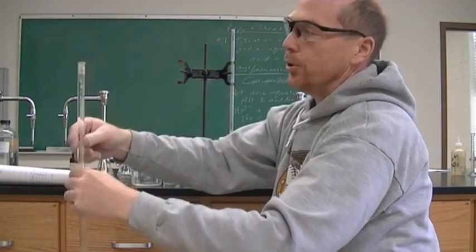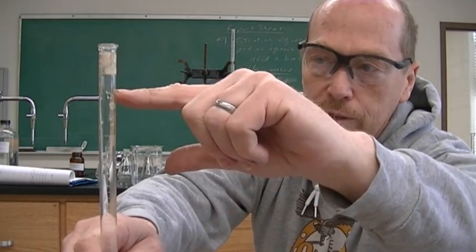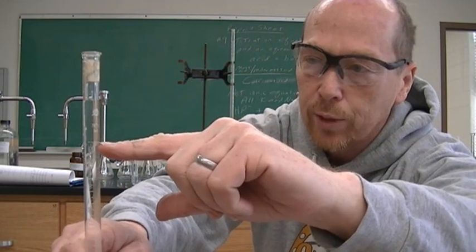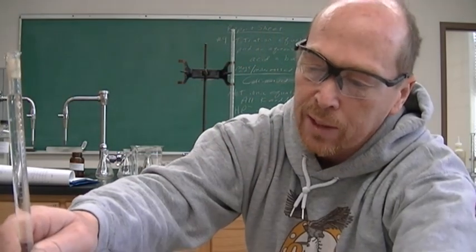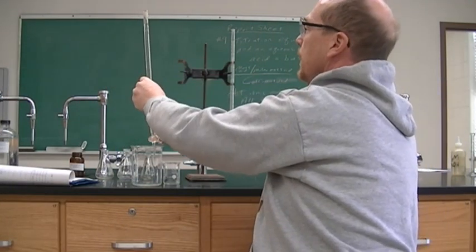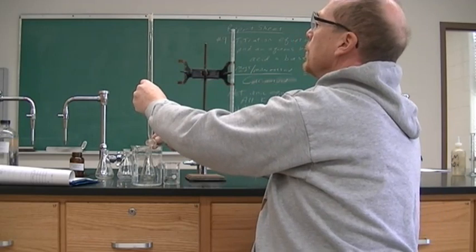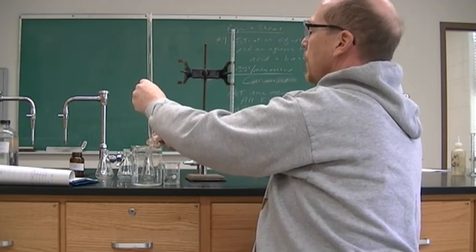So when you have a burette, the liquid is up here now. It has to always be between the 0 and the 25. It should never be above 0 when you're titrating. It should never go below the 25. All right, and so I'm going to bring it down to 0. All right, so I have it.